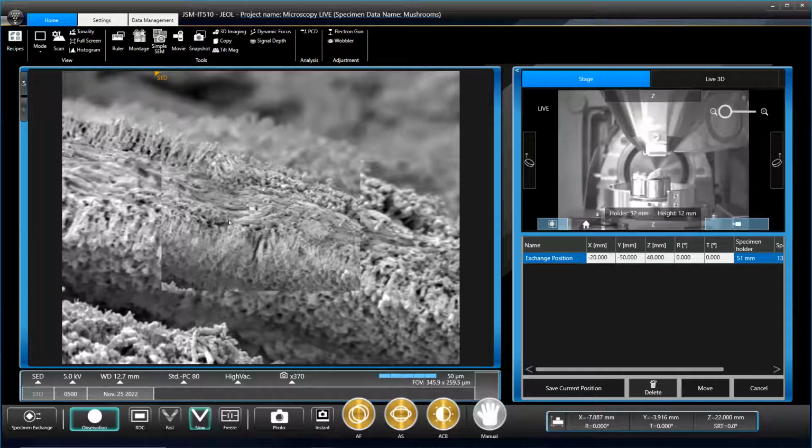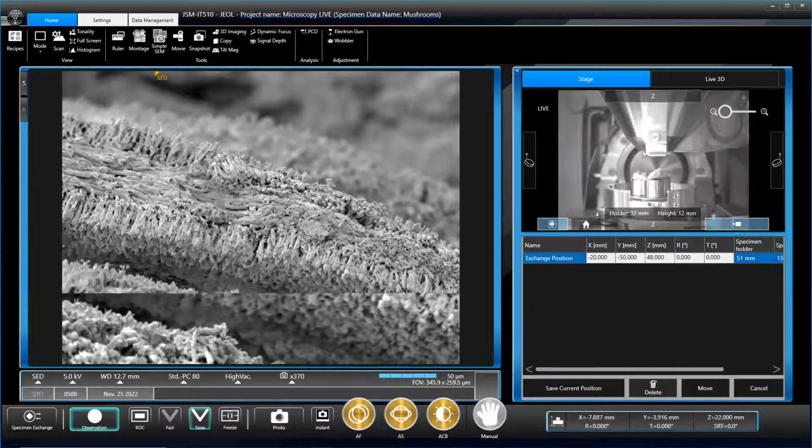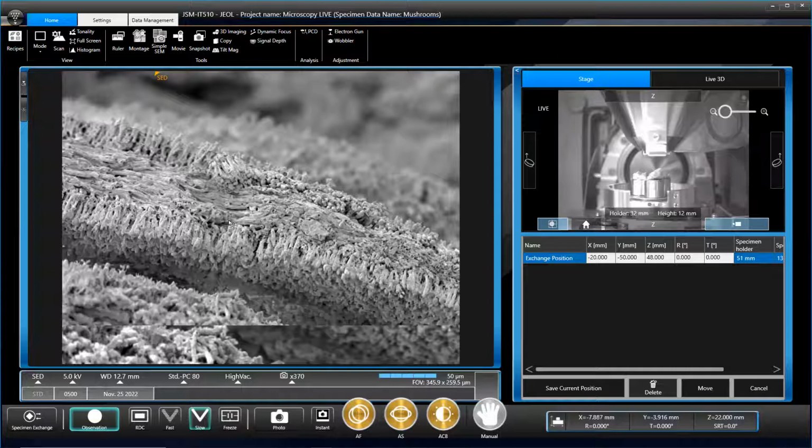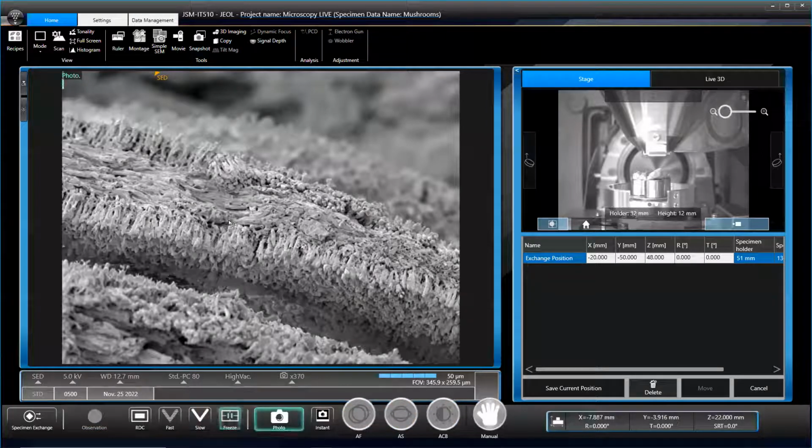I wonder if different spores would have different shapes as well, or if they're all just kind of round. Pollen is generically round, but they all look very different from each other. I think they do vary. Obviously, I only study one organism at the moment, but I think typically they're often teardrop shaped.